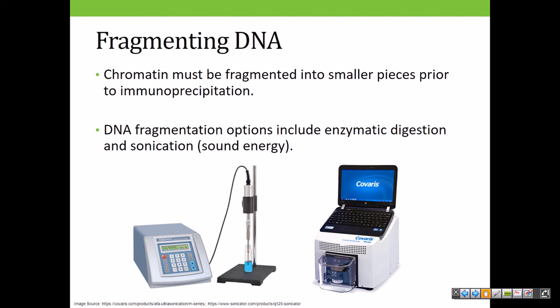And heat can denature your proteins, destroy your DNA, and destroy your experiment. So you've got to keep that sample cold. The sonicator on the right is the one that I use that's actually a little fancier. It has a water-cooled chamber located in this front portion, protected by a little bit of plastic. And so I can sonicate while the chamber is kept cold with water. But in either case, the sample is still kept cold.